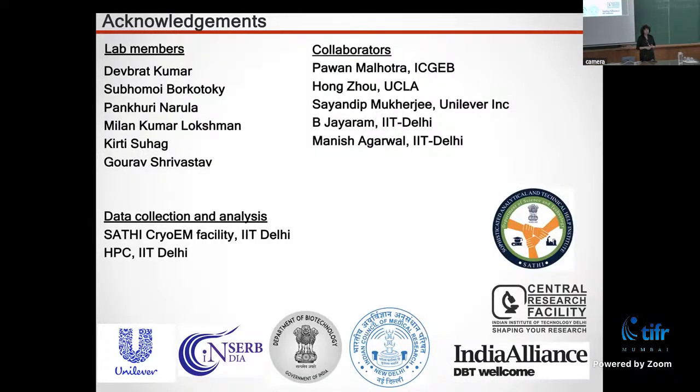To answer your question, this is something that is being done already. It is a technique called cryo-electron tomography and subtomogram averaging. It is not at the resolution of single particle yet, and you can only look at very identifiable features. There are reports where people have sectioned cells and identified specific protein complexes like the ribosome.